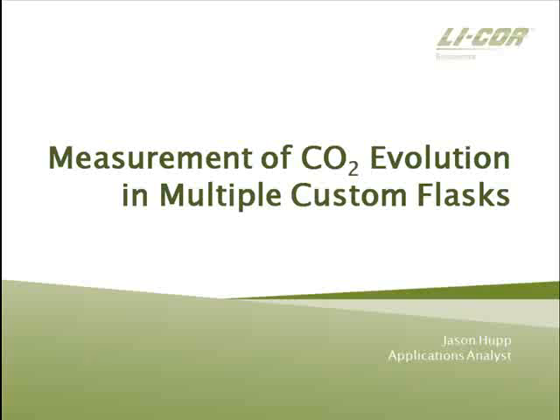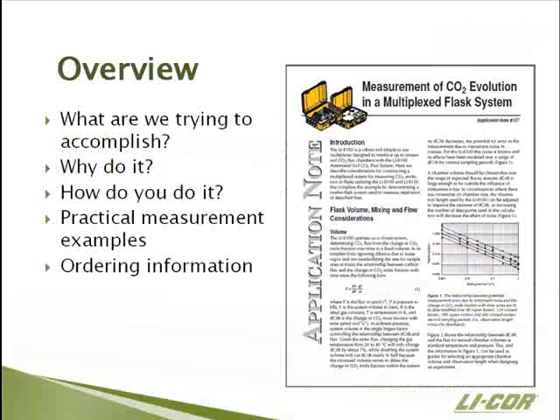Today I'm going to talk to everybody about measurement of CO2 evolution in a multiplex Flask system using the LI-8100 soil CO2 flux system. I'd like to start by talking about what we're trying to accomplish with this webinar, why somebody would want to go about making these measurements.